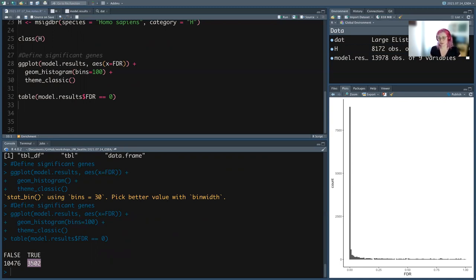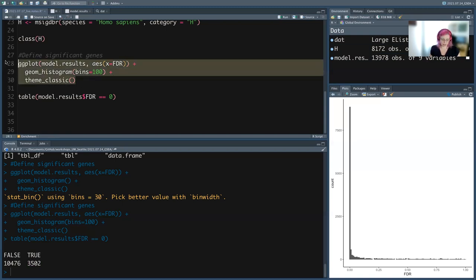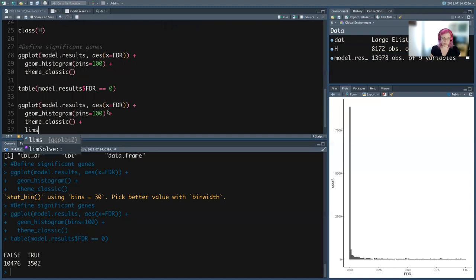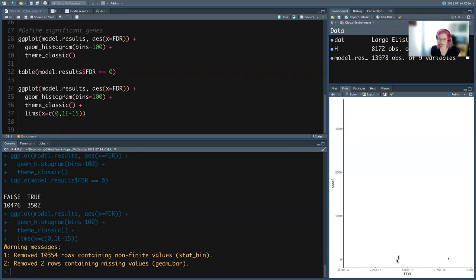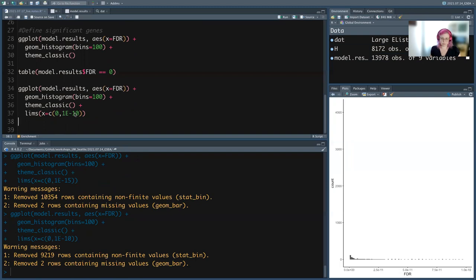In fact, there's a caveat with these data. Using table(), if we look at the model results FDR and ask if it's exactly equal to zero, we see 3,500 values that are zero. This is not real — FDR is never going to be exactly zero. What happened is the algorithm we used to run our linear model stops calculating at around 1e-16 and gives a value of zero to save time. We've since rerun this and you get values on the order of 1e-50, so they're basically zero but not exactly zero. That's why we see an incredibly large bar right at zero no matter how far we zoom in.